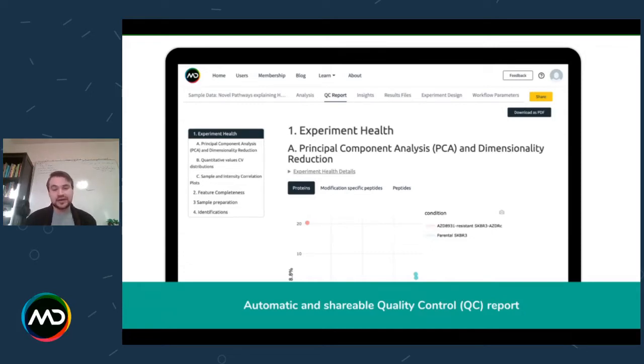In the other camp, we have people who try to go a bit quicker, but they do, and you always run that risk that you've missed something about your experiment, about your data acquisition that actually makes your analysis not okay. And if you've missed that and you start doing your analysis, then that's a shame, and you pick it up later, and it's really annoying.